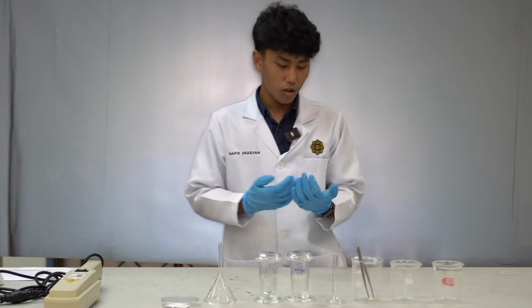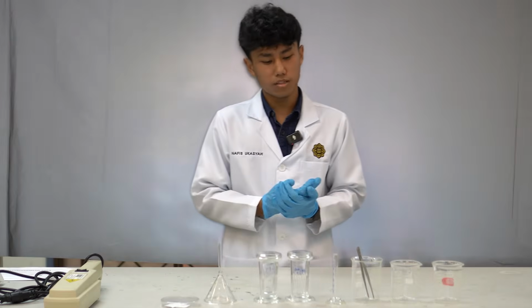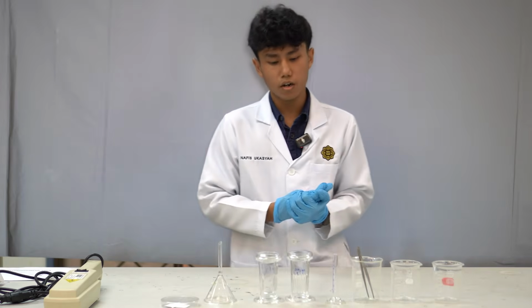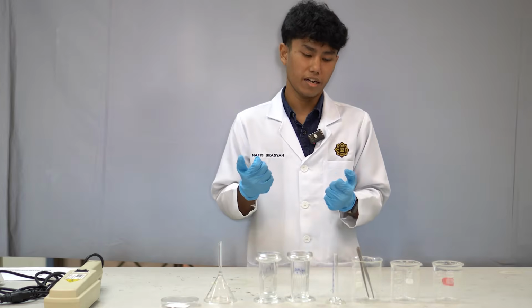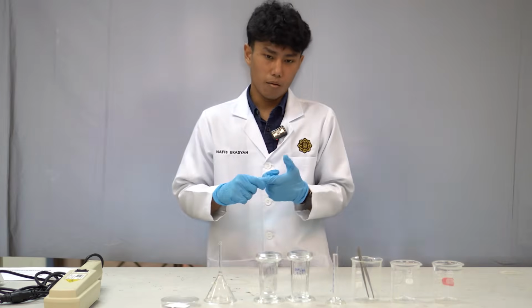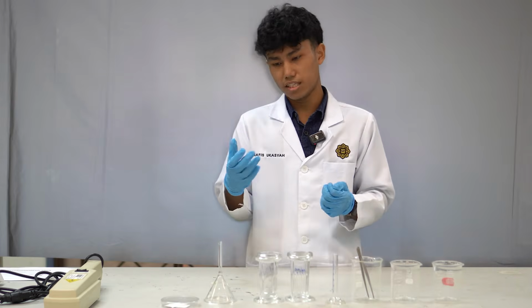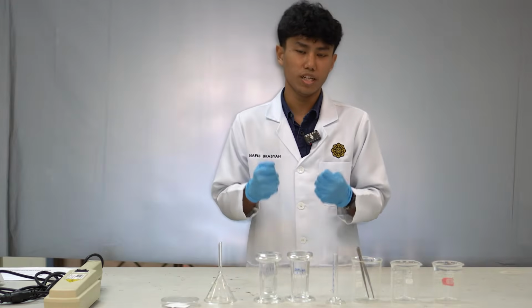Okay, I will talk about the precaution and safety. First of all, before doing any experiment, we need to wear a lab coat, gloves and closed shoes. Why? Because we are dealing with harmful chemical reactions that can irritate our hands and our eyes. Why do we need to wear it? Because while we do an experiment, harmful chemical solvents can spill onto our hands, so we need to prevent it.